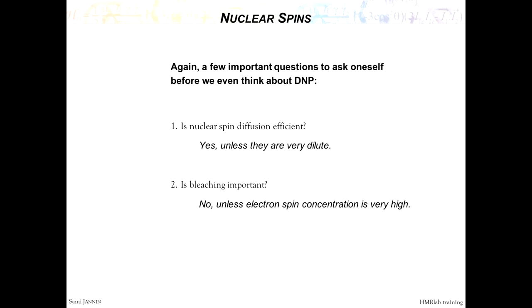Because there are always parameters that you don't know. Like you don't know your B1, you don't know the exact distribution of radicals. I mean, it's really hard. It's really complicated. And the sample is so messy. Maybe it would be possible with full quantum simulation in a very simple system, a crystal with well-defined position, but in the glass, I don't think it exists. I don't know. Do you have any paper in mind where this has been done?